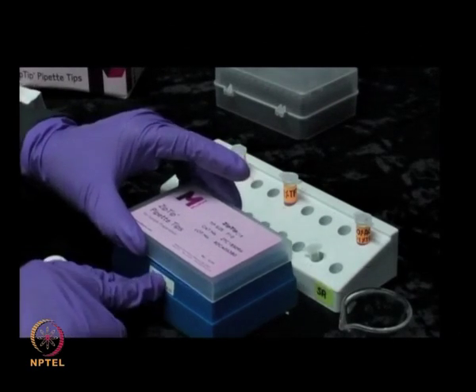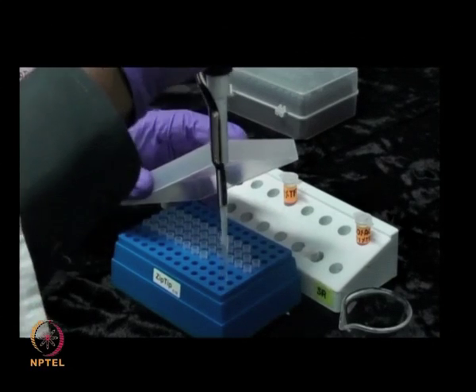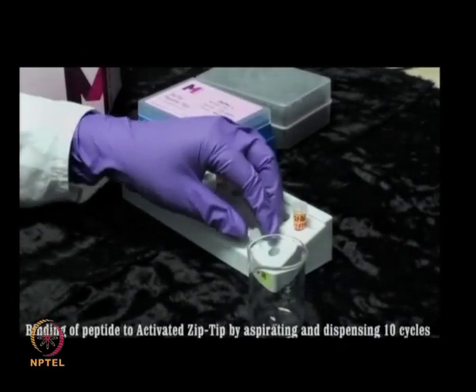In-gel digested protein samples can be further processed by using ZipTip. This animation shows the washing solution of 0.1% TFA passing through the ZipTip column.